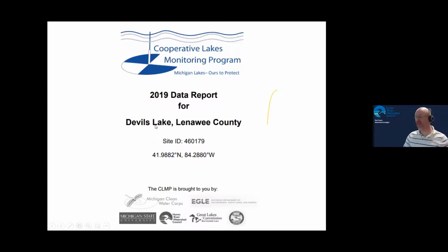Okay, so I do want to just, that's chlorophyll A. That's the process of both collecting and filtering the samples and getting them into us for analysis.